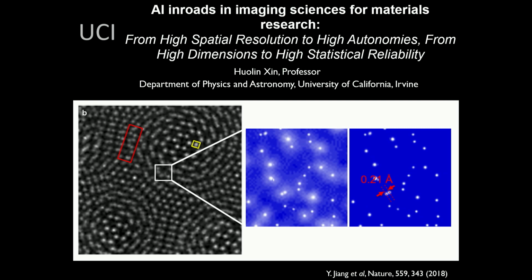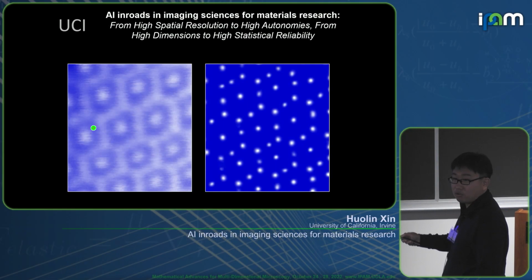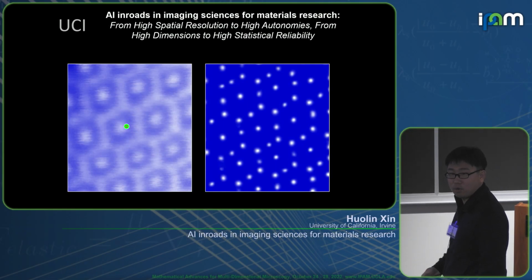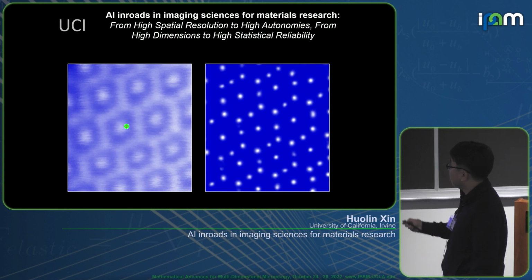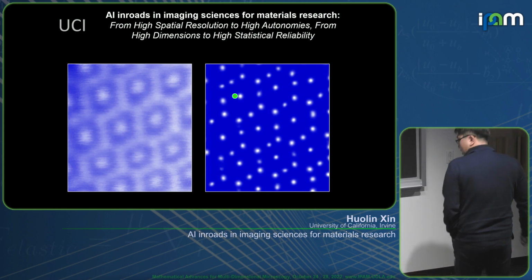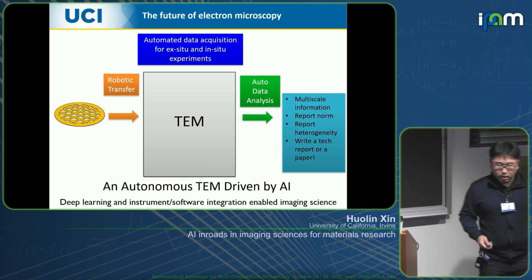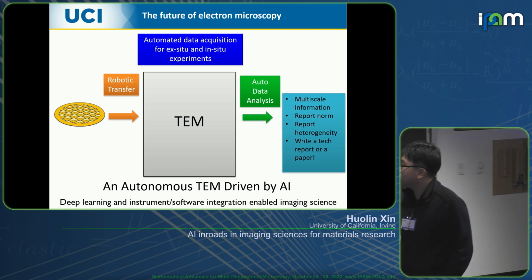All right. Where it can actually help people who are not electron microscopy experts is, for example, when looking down at spinel cobalt oxide, Co3O4, or manganese oxide. When your resolution is a little bit shy of the contrast needed for resolving the 3 atomic columns, you're kind of wondering what the structure of this is, right? And using my super resolution network, bam, all the 3 atomic columns come out, right? Isn't it fantastic?